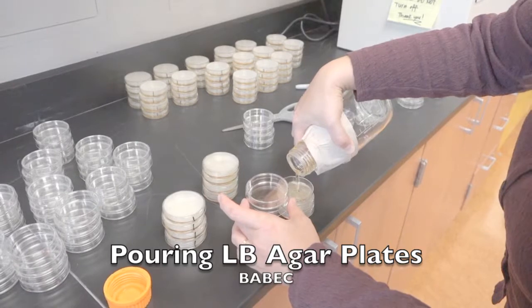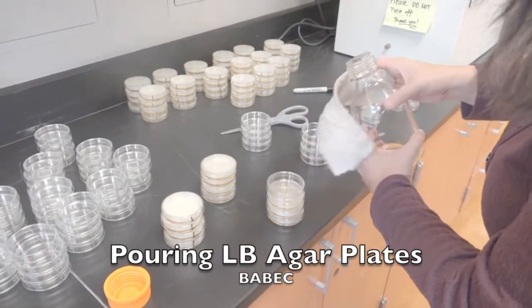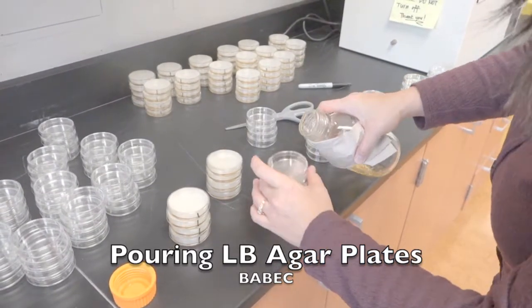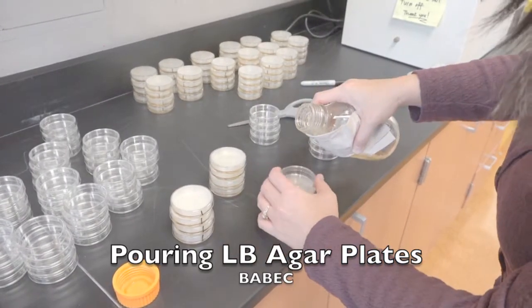Notice my bottle is starting to drip. What I can do is turn my bottle so it gets to a cleaner part of the bottle itself, so I avoid drips. So that one's already been poured.